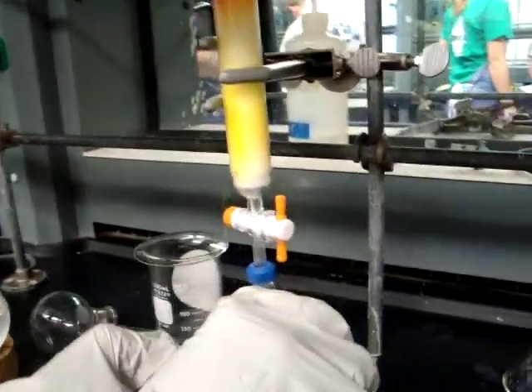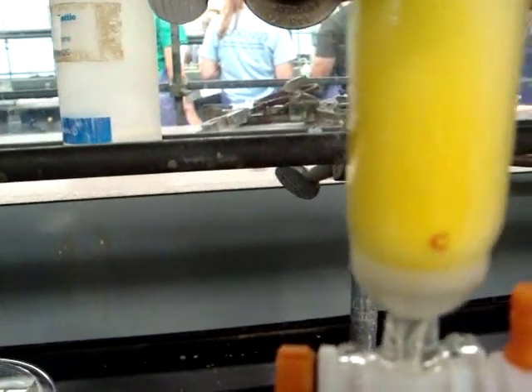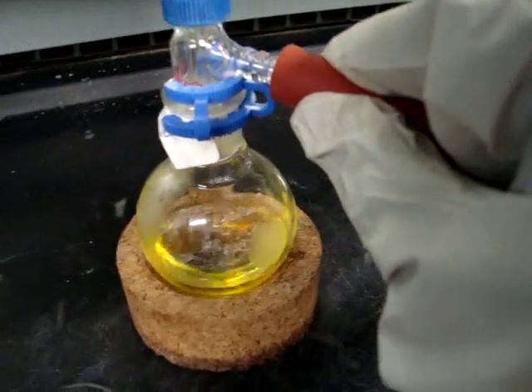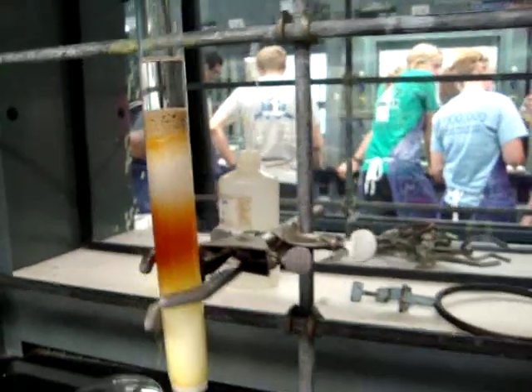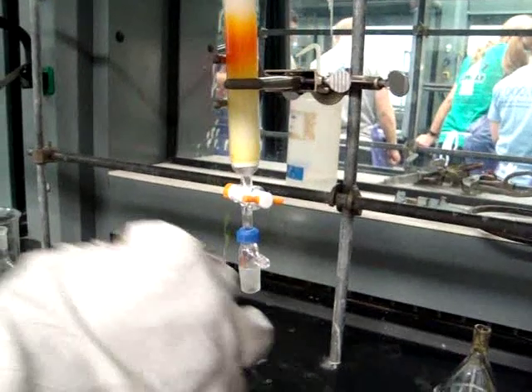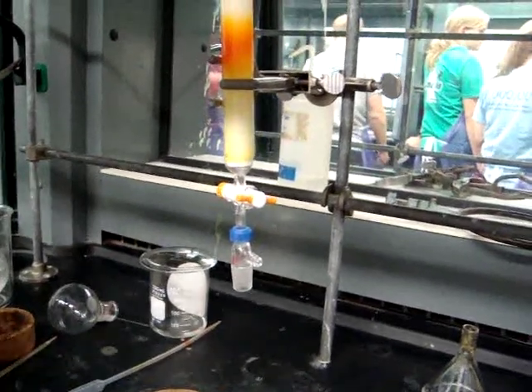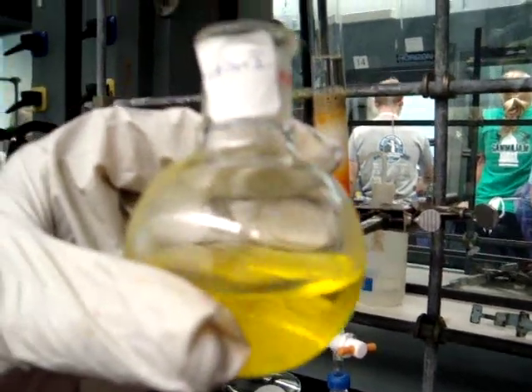Make sure that you collect the yellow band completely. You will collect all of the yellow until you've reached the red band. As you can see, what you are collecting is yellow in color. Remember, you want to have solvent still on the top so that your column does not dry out. Then turn off the stopcock, remove the vacuum, and remove the flask from the column. This is the beta carotene solution that you will be collecting.